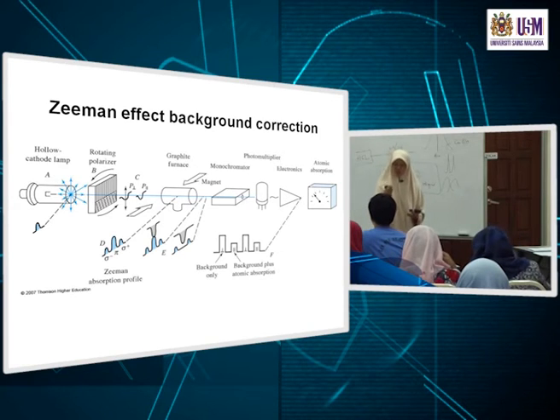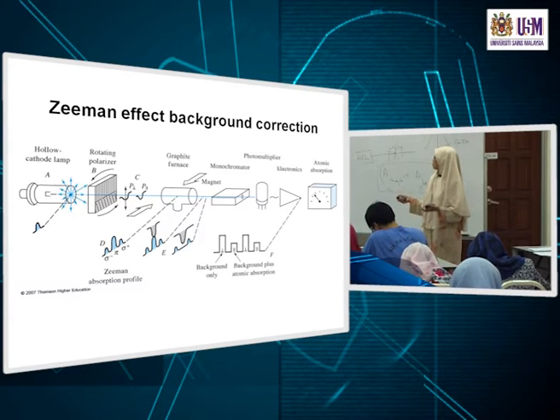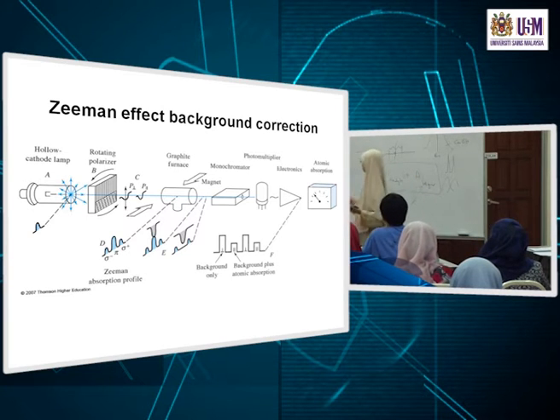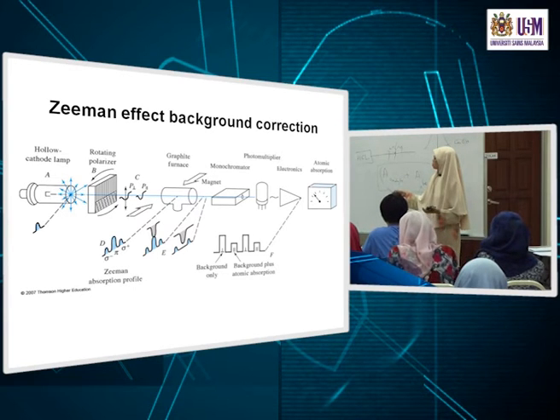So that's why I say these terms you must try to understand. That's what we went through, reflection, all these terms about optics, which came from physics, that you have to understand because it's used in instruments. Okay, so that's why we show here absorption only from the sigma, the two humps at the side. You don't get the absorption in the middle.